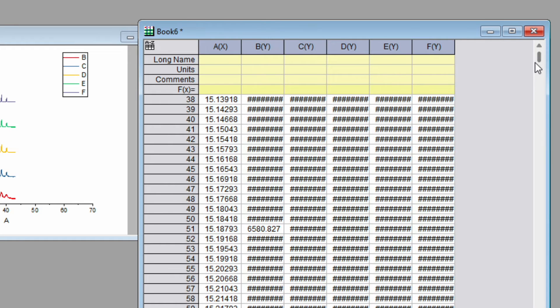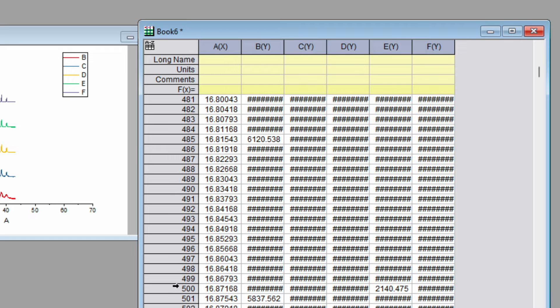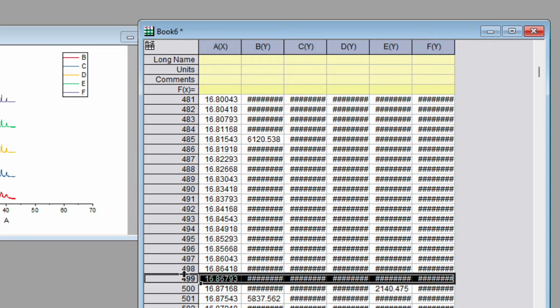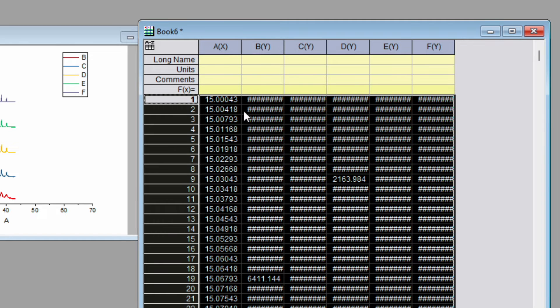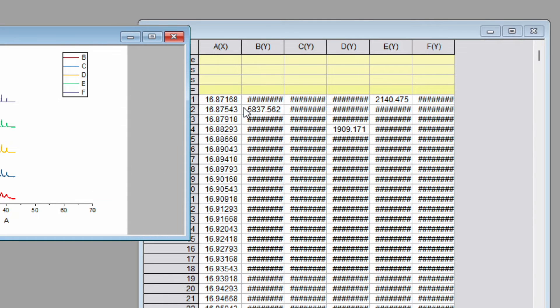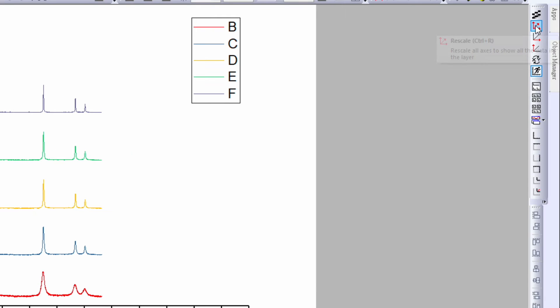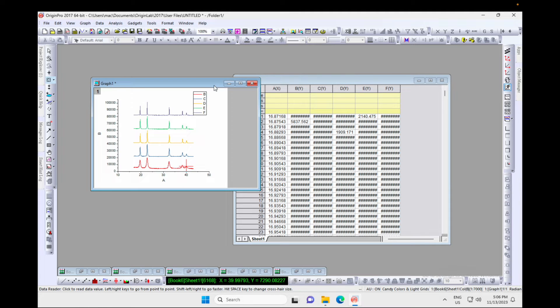Similarly, go to the lower end, choose row 500 as the start, press Shift, select downward, and delete those rows too. Now we have a limited range. Go to the right-hand side and click 'Rescale' — the shortcut key is Ctrl+R. The plot will rescale and become much clearer. Now we'll move on to the 2D plot.